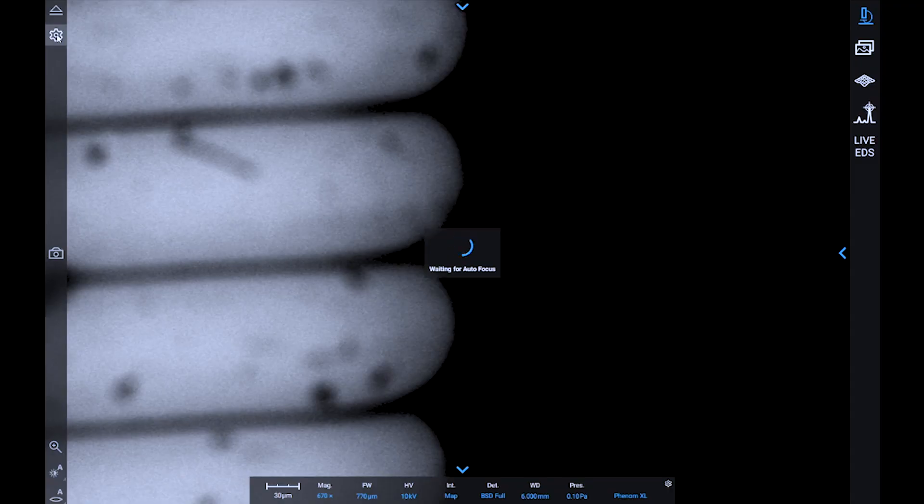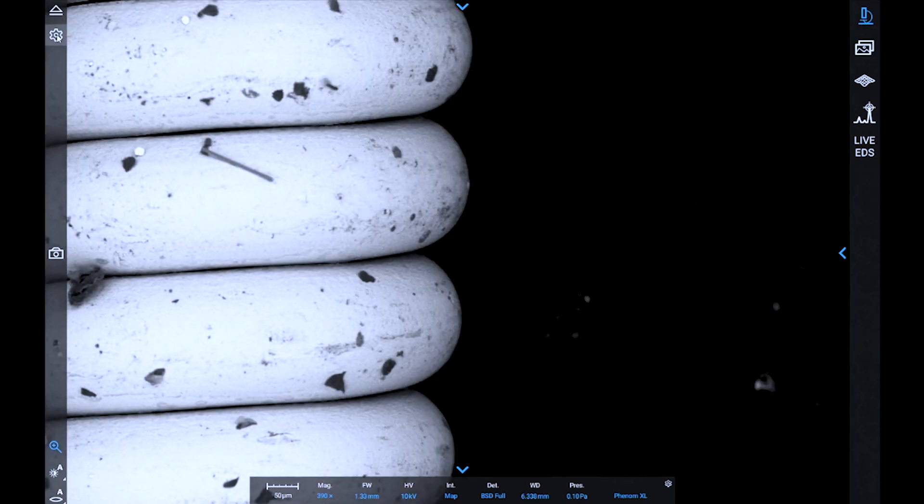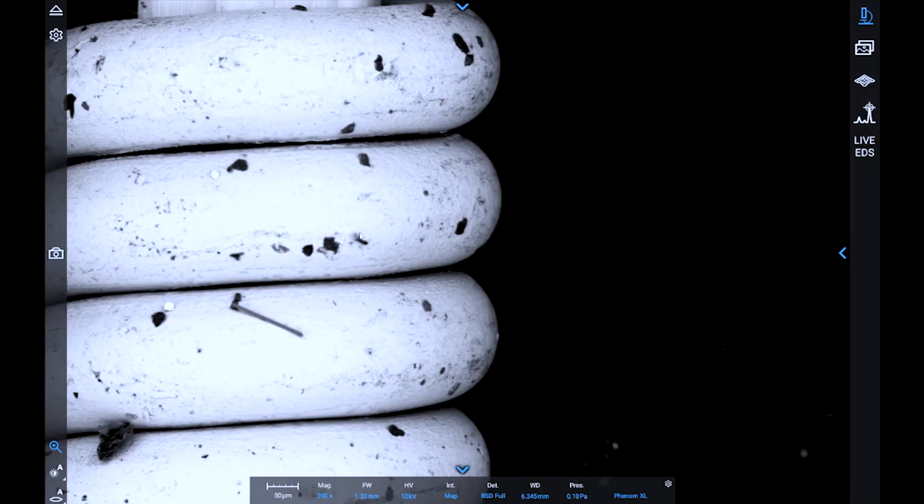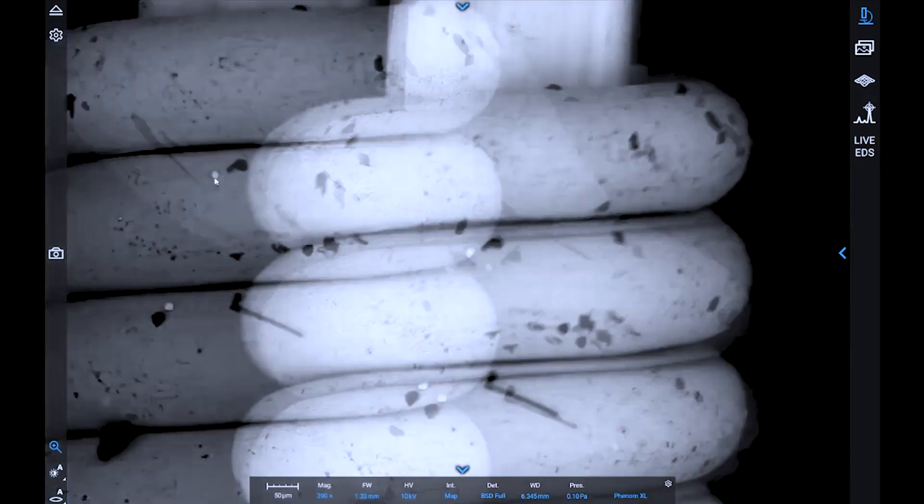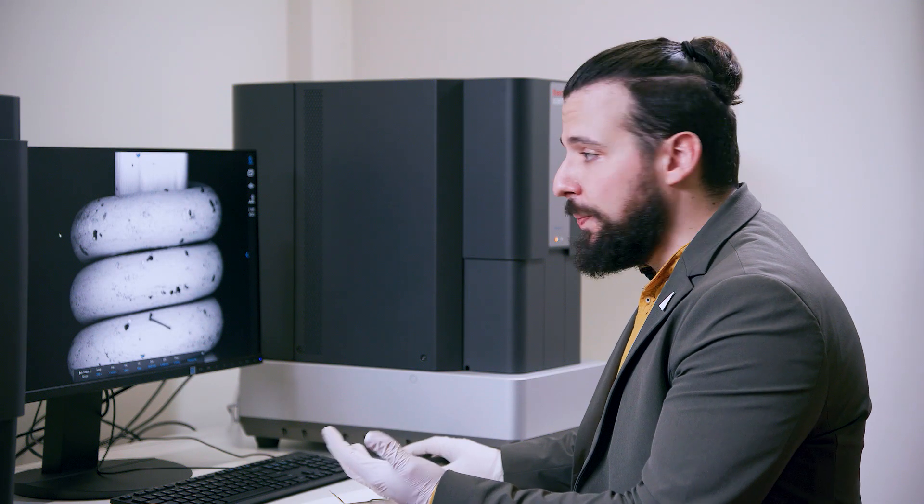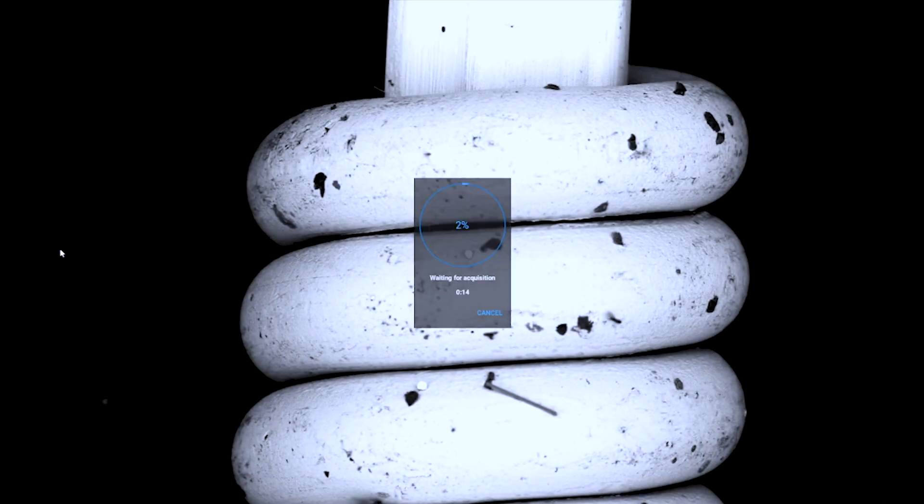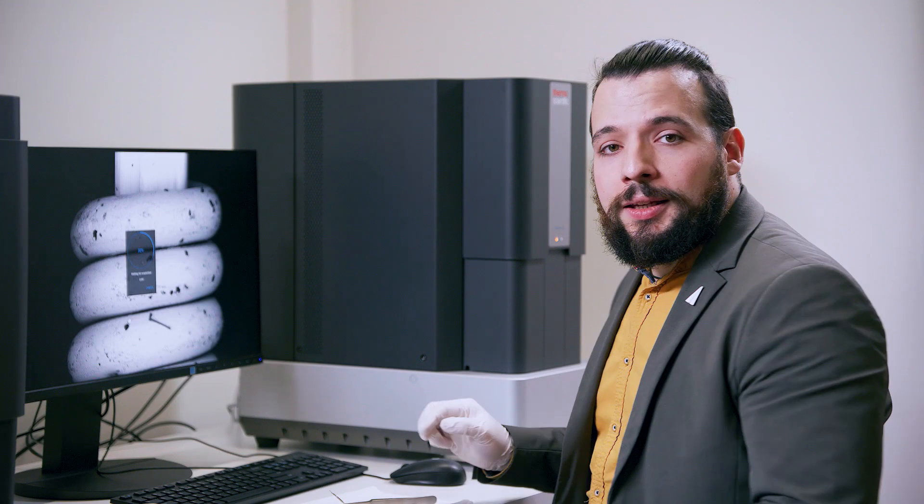Whenever the sample is under the electron beam and we acquire an image, we start automatic focusing and contrast brightness adjustments, so that the first image that appears on screen is ready for acquisition. All you need to do is select the area that you want to scan by clicking on it and clicking the acquisition button. This way, the image is stored on your drive and you can later access it.